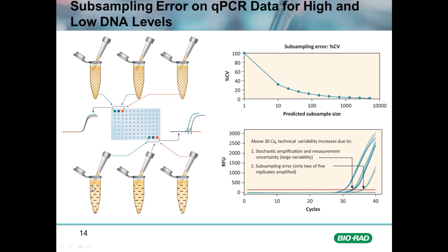Subsampling error is the error associated with taking a portion of the cDNA or genomic DNA sample used for qPCR. We only take a sub-portion of the sample, and because the DNA is so dispersed in the tube, it is based on the chance that in that subsample there will be a consistent number of target molecules. The consistency of target molecules taken decreases dramatically as the number of target molecules in the sample decreases.